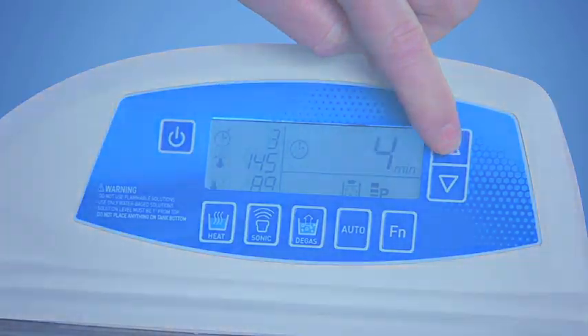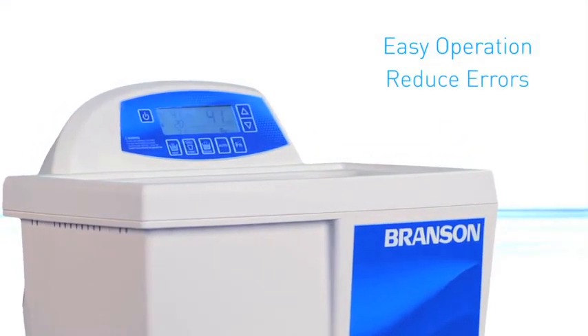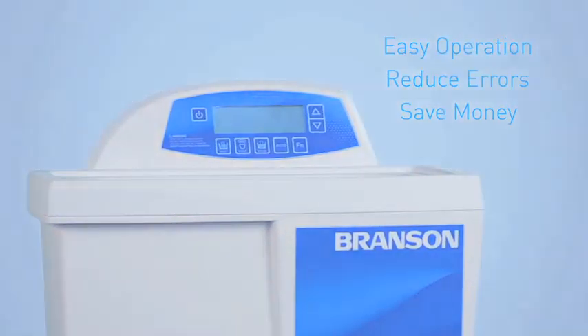All you have to do is adjust the time and temperature, if needed. It's hassle-free operation, with the lowest margin of error to help you save time, money, and peace of mind.